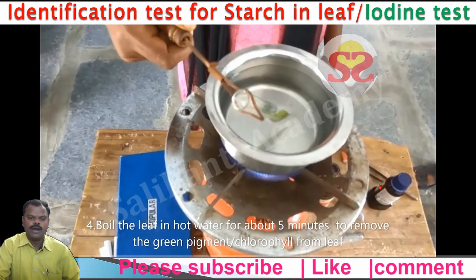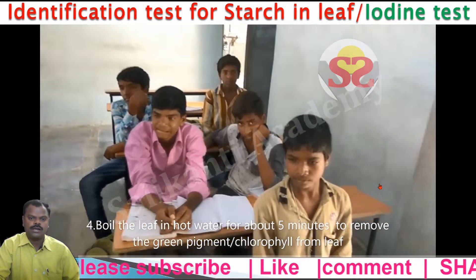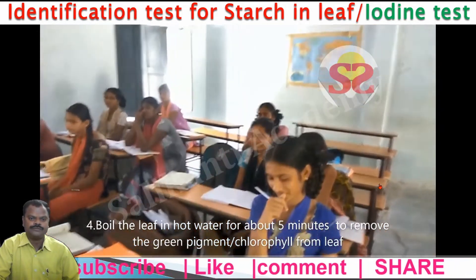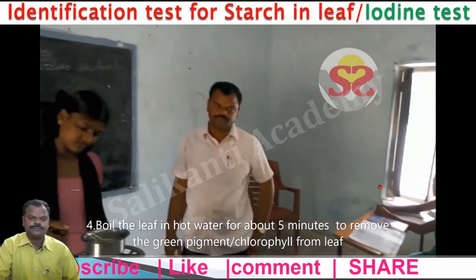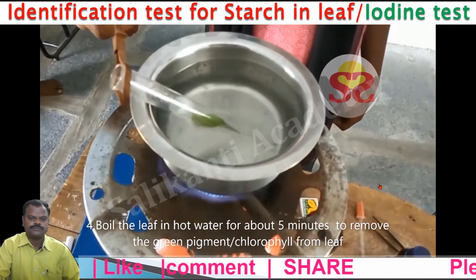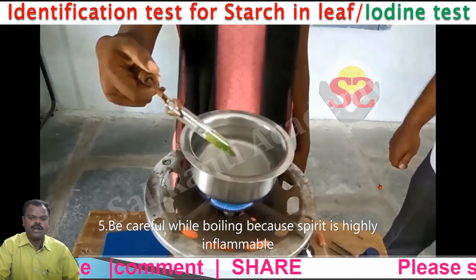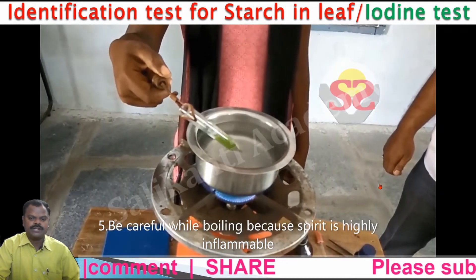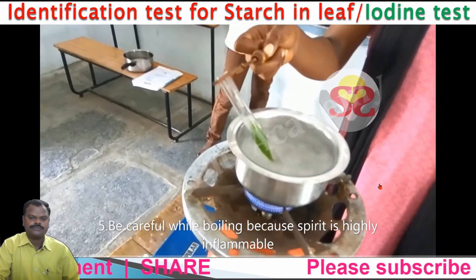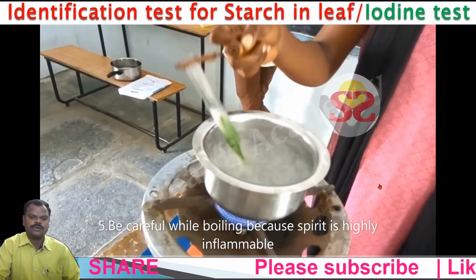Boil the leaf in hot water for about 5 minutes to remove the green pigment or chlorophyll from the leaves. Children, be careful while boiling because spirit is highly inflammable. Always put the test tube opposite to you.